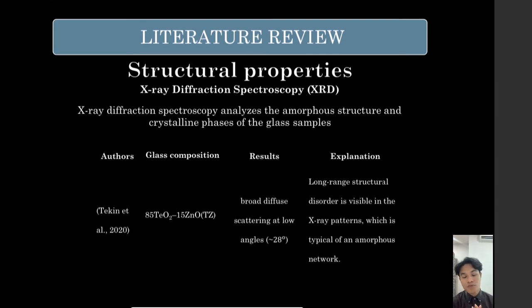And the last structural property that has been used is XRD, which is X-ray diffraction spectroscopy.